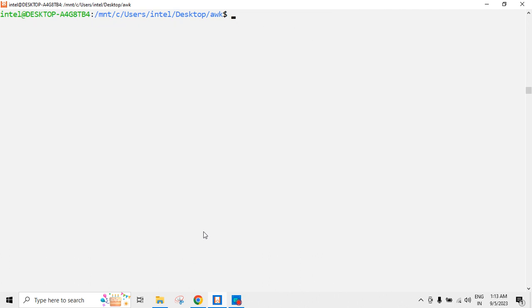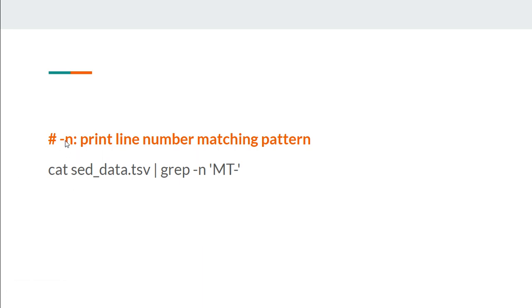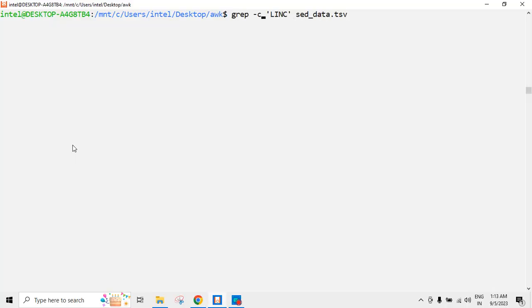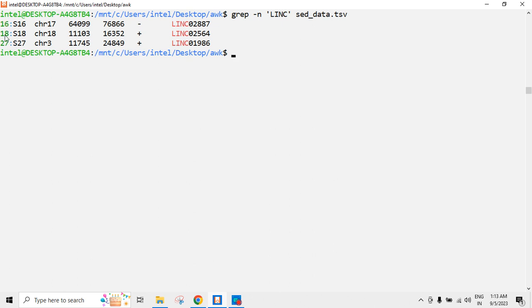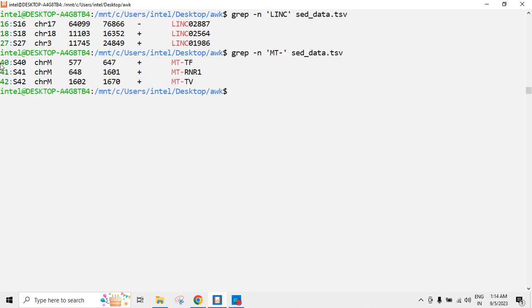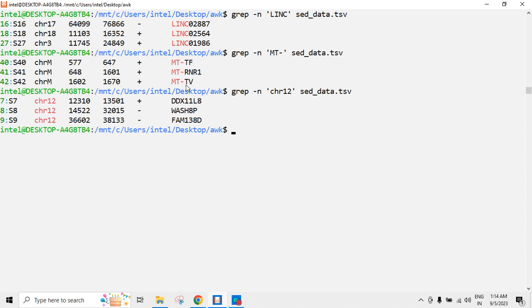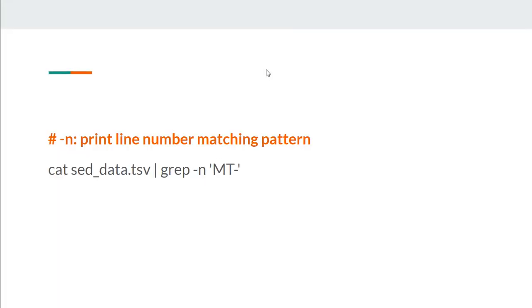There are three lnc genes as well, and we can give hyphen C to just get their count. So hyphen C is for count. Now the next flag is N. N will print the line number as well. So if I want to know which line they are present in — for lnc genes, they are present in lines 16, 18, and 27. For mitochondrial genes, lines 40, 41, and 42. And for chromosome 12 genes, they are present in lines 7, 8, 9, and so on.